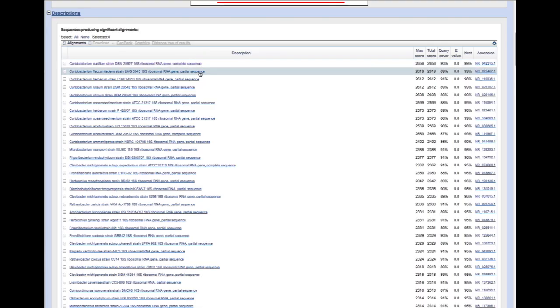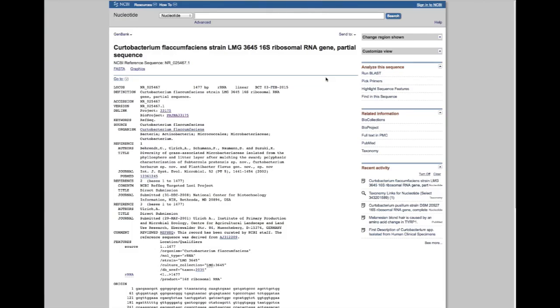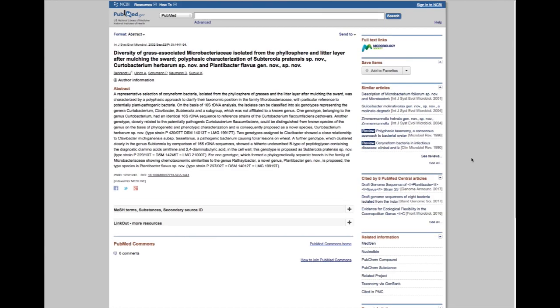But there isn't much information about this species beyond its taxonomy. Let's go back and look at the next best match on our results table. It is Curtobacterium flaccumfaciens, also with 99% identity over 1,461 nucleotides. In addition to the information on this sequence and the strain's taxonomy, there's also a link to a Medline abstract on PubMed. Look at the title — it's a paper on grass-associated bacteria. Since you're interested in plant-associated bacteria, perhaps you could lead a journal club on this paper and we can learn a bit more about the genus Curtobacterium.